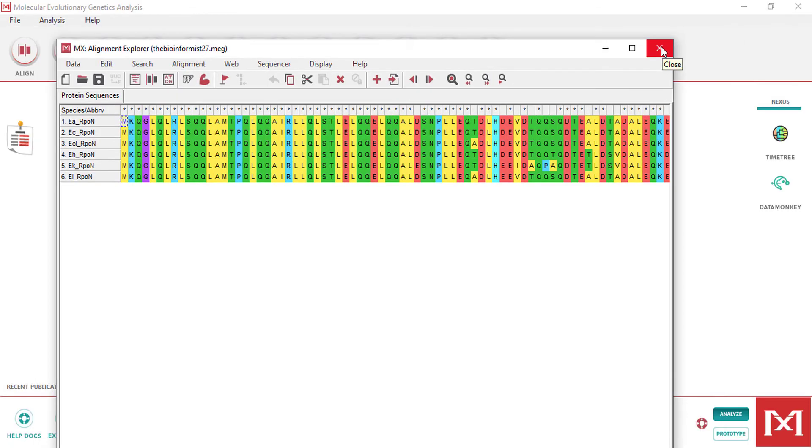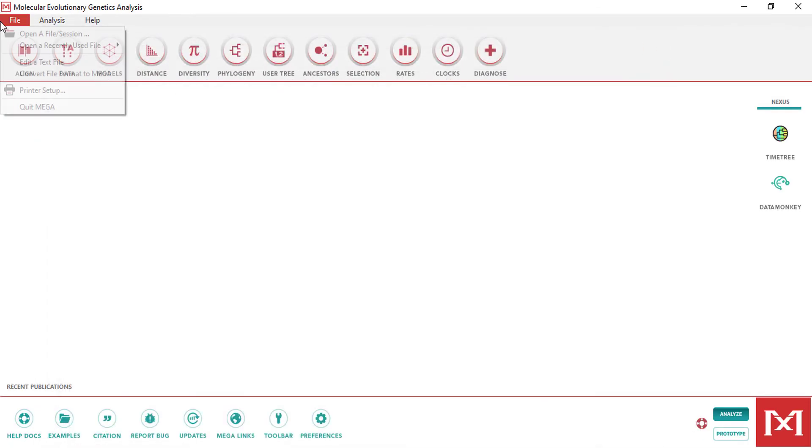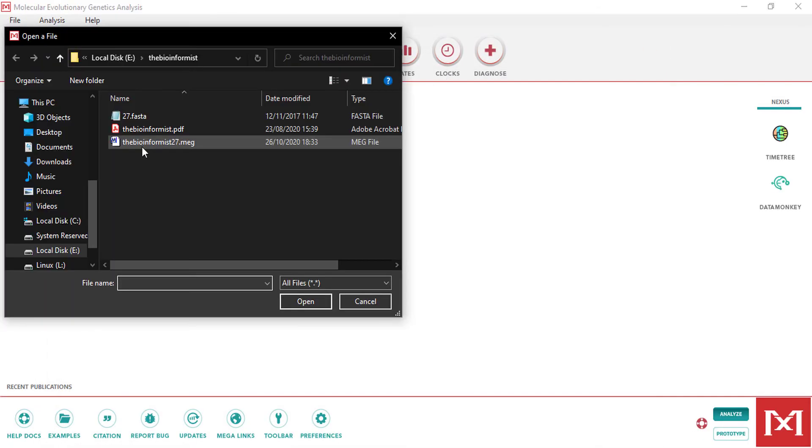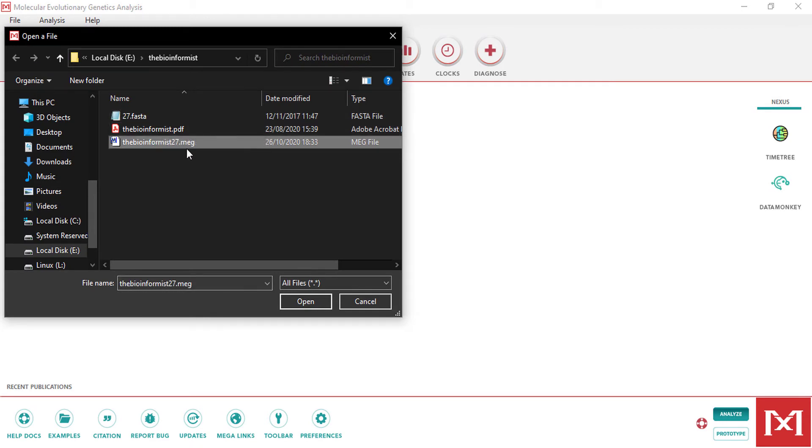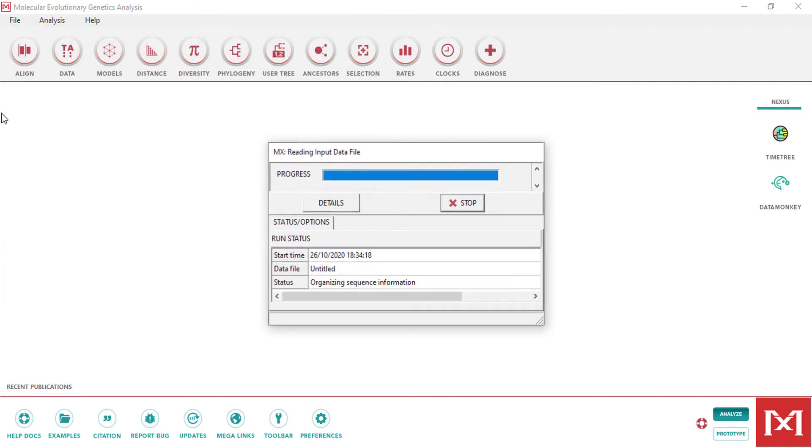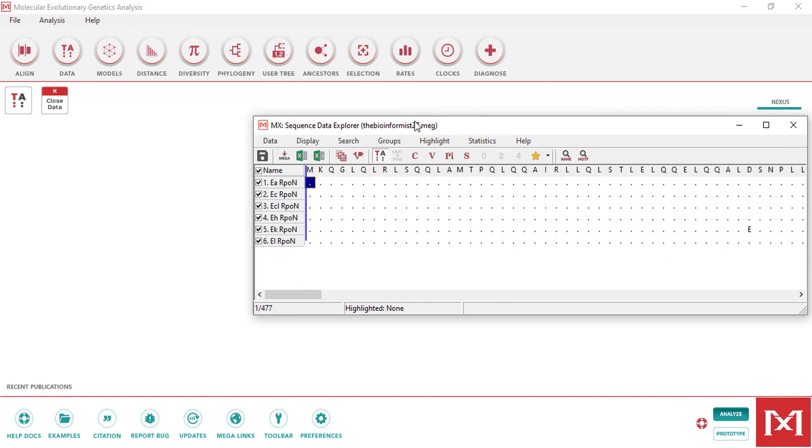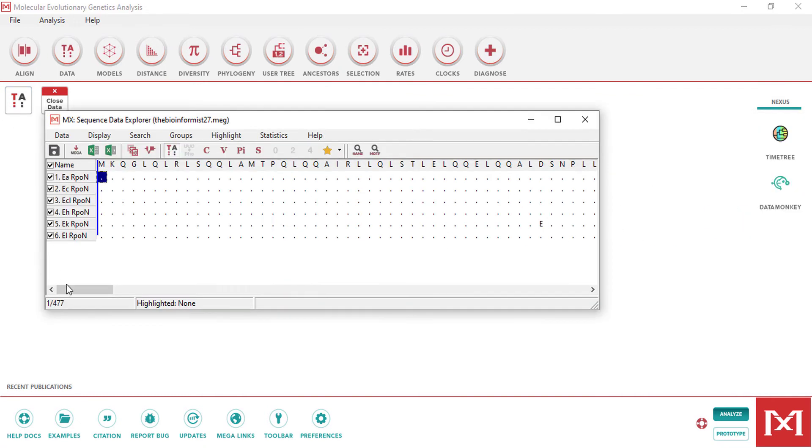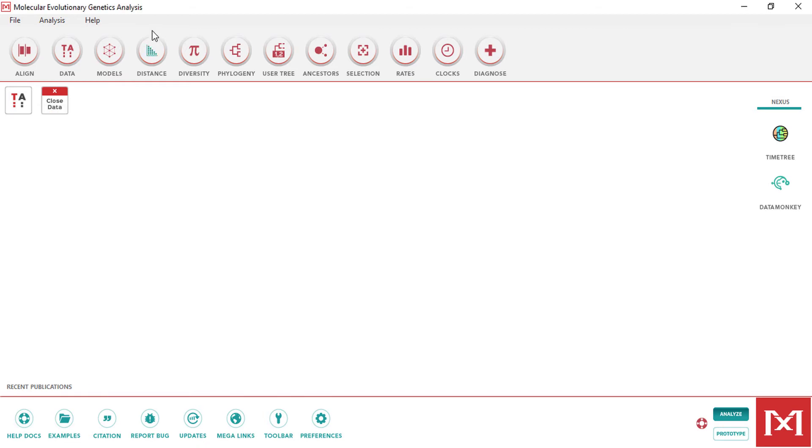I need to close this file and now open again the mega file. Open a session again just like we did for FASTA format. This time we are choosing mega format and open. This will automatically open the aligned protein sequences. Here we can see this is the sequence result. These are the six proteins that we have aligned using MegaX.